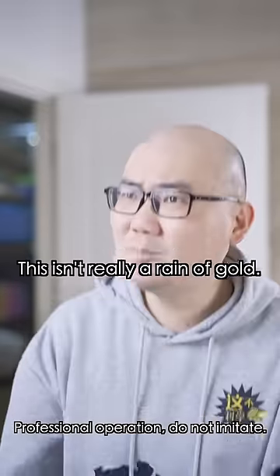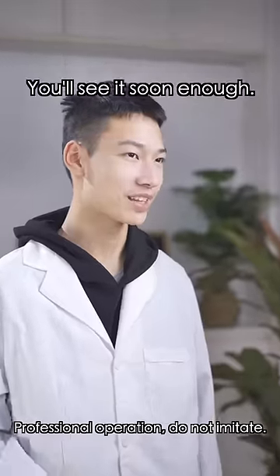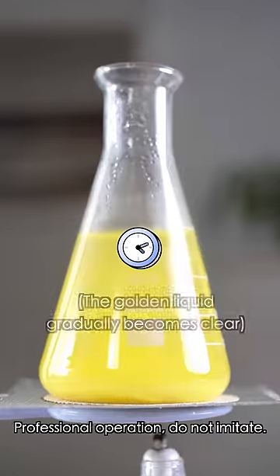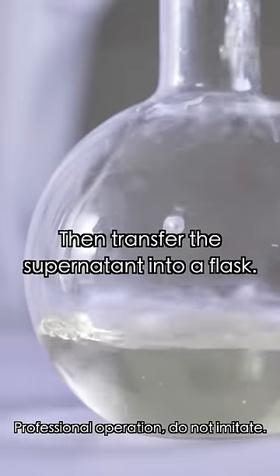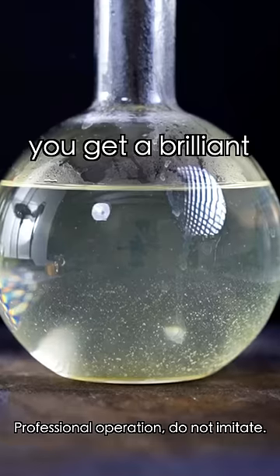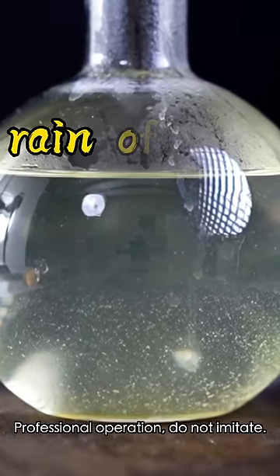Hold on — this isn't really a rain of gold. Just wait, you'll see soon enough. Heat the liquid. The color disappeared! Then transfer the supernatant into a flask. When it cools, you get a brilliant rain of gold.